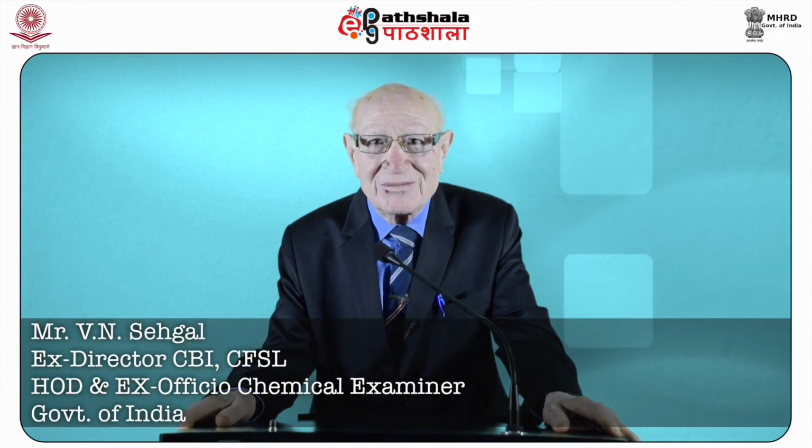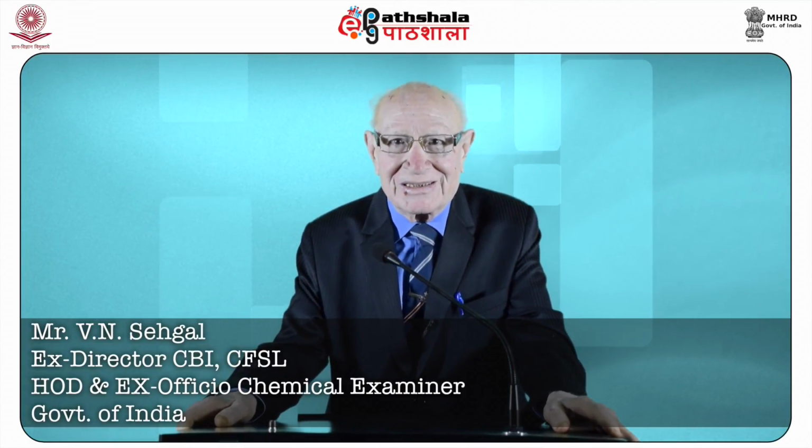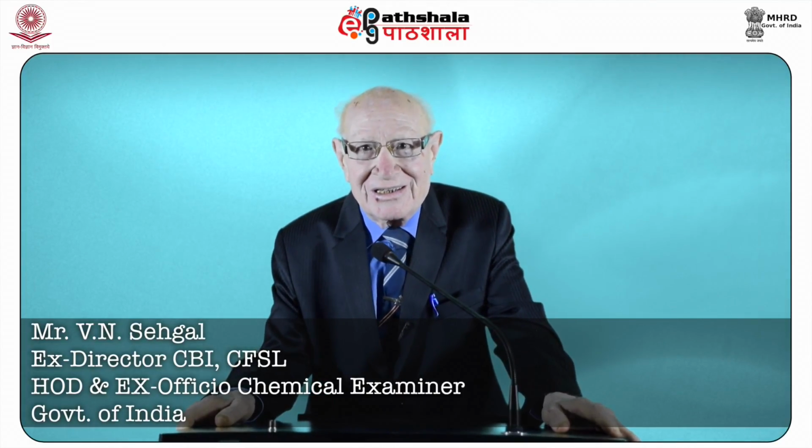Today we shall discuss GSR analysis by instrumental methods. There are two types of methods which are used for the estimation of GSR particles. The examination is carried out either by chemical analysis or by instrumental analysis.